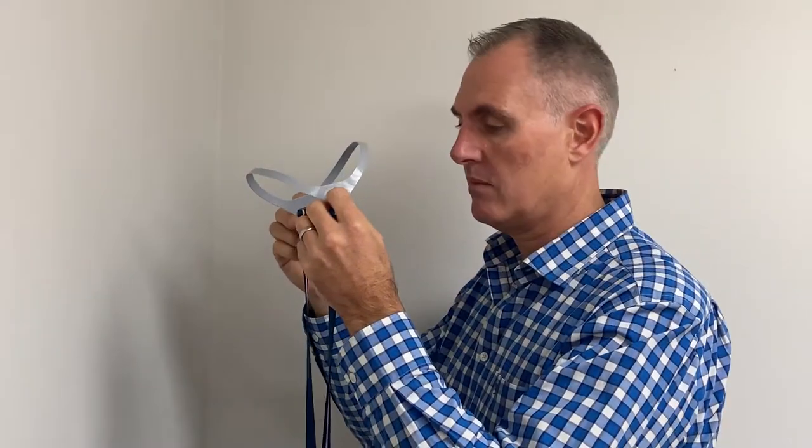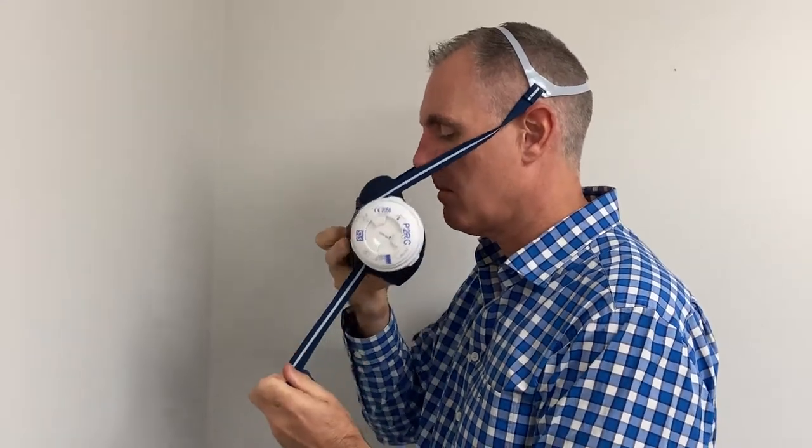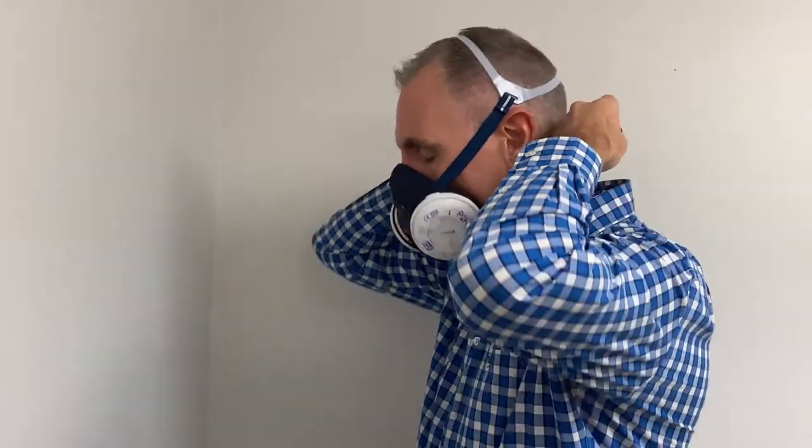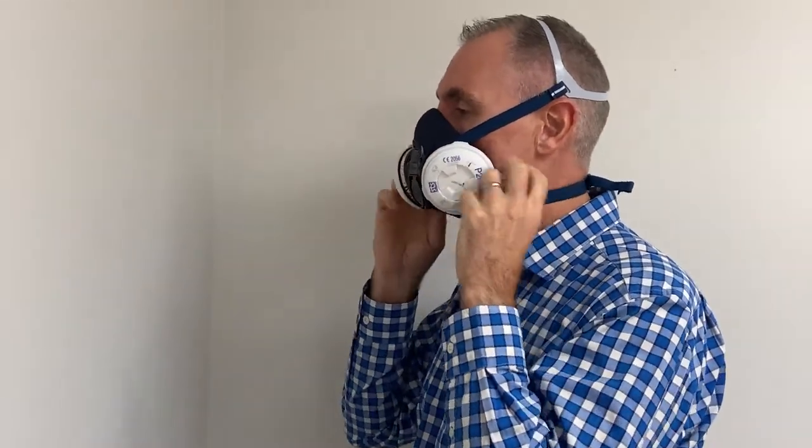Secondly, place the seat over the crown of your head, ensuring there are no twists in the straps. Next, grasp the two bottom straps in one hand and pull the mask up to your face with the other hand. Then using both hands, connect the bottom strap behind your head. Adjust straps to get a firm snug fit.